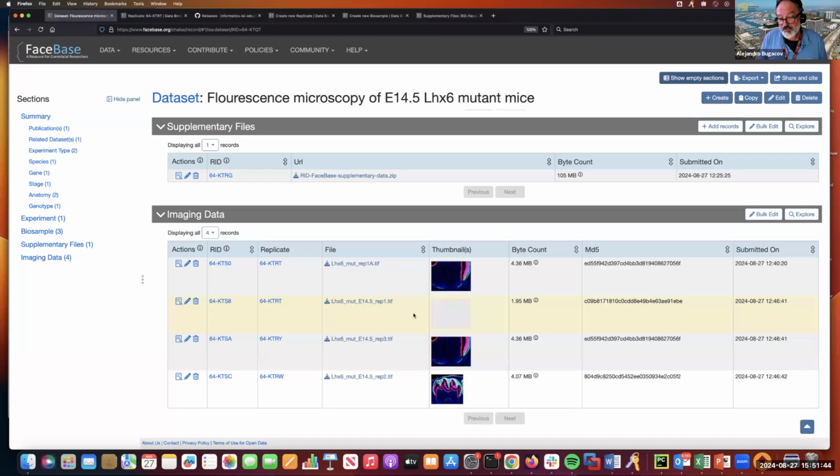And for example, it's very powerful if you were to submit a Z stack, you know, a TIFF file where you have an actual stack of three-dimensional images. It will process them all and generate a film strip for each section, for each slice of your file. Or, if you have a file that contains different channels, it will also be able to process that and visualize each independent channel.